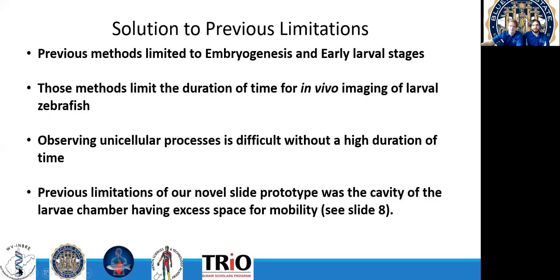Previous methods to image zebrafish were limited to embryogenesis and early larval stages. Our goal is to design a novel microfluidic slide for mounting zebrafish that greatly extends the duration of time for in vivo imaging of zebrafish larvae that are 6 to 7 days post-fertilization, while supplying drugs or nourishment that are fluorescently labeled to observe unicellular processes. The ideal mounting slide will maintain the larvae in a mostly static condition, have channels to provide media exchange, nourishment, and/or drug treatments, and channels to flush waste and any lingering test conditions. The Walters Lab has developed methods to track key lipid processing proteins and dietary lipids during absorption.